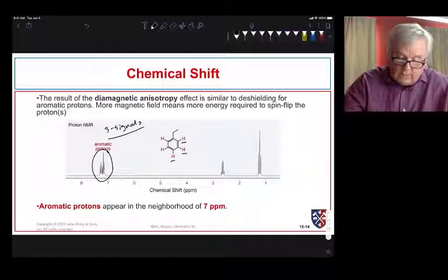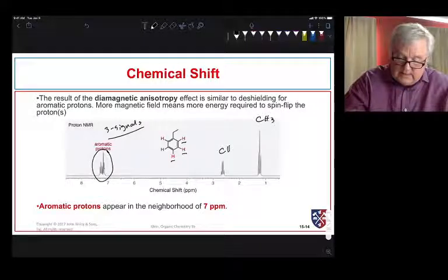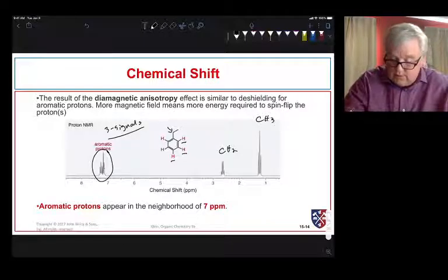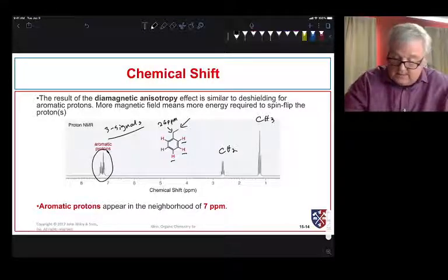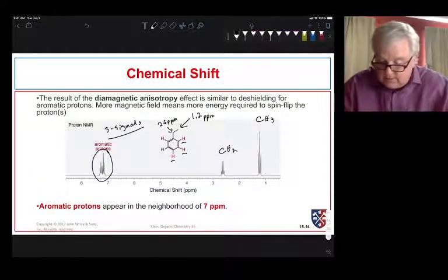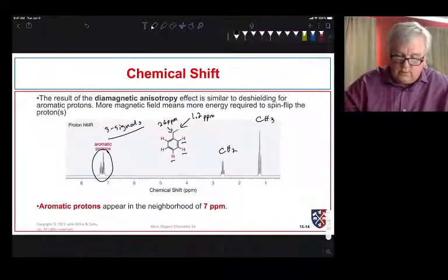And notice now as well, there's protons. That's a CH3 group. Don't forget your bond line diagram. So this is due to the CH3 group, and this is due to the CH2 group. This is our CH2. So that comes at about 2.6 ppm, and the methyl group comes at about 1.2 ppm, I'm going to guess. I could expand it. Maybe we call that 1.21, 1.22.